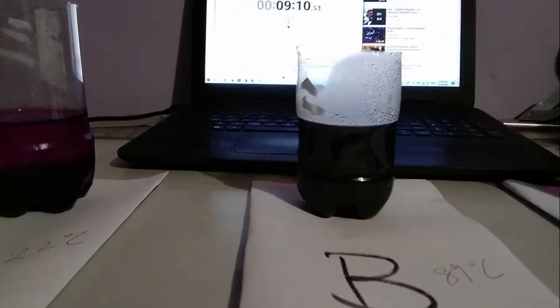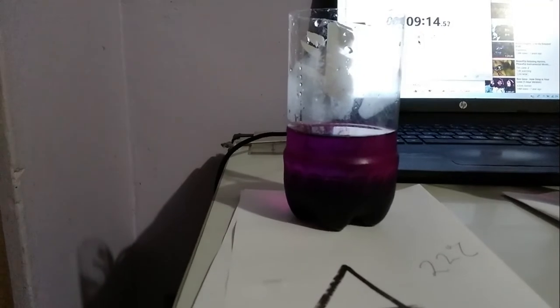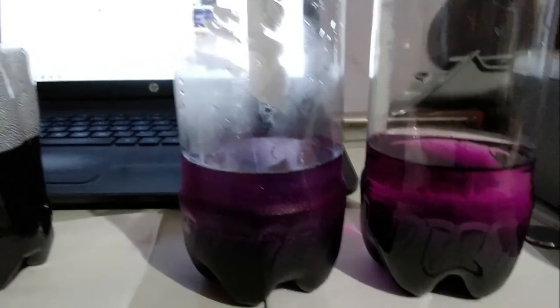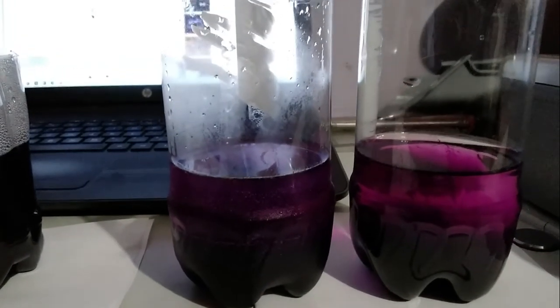That's specimen B, and you can see the temperature there. And this is specimen A. I do hope that the lighting is pretty much the same. So just to look at specimen A and C, I'm going to be putting them beside each other, just to ensure that we have the same type of lighting and we can make a decision. So that's what's happening there.